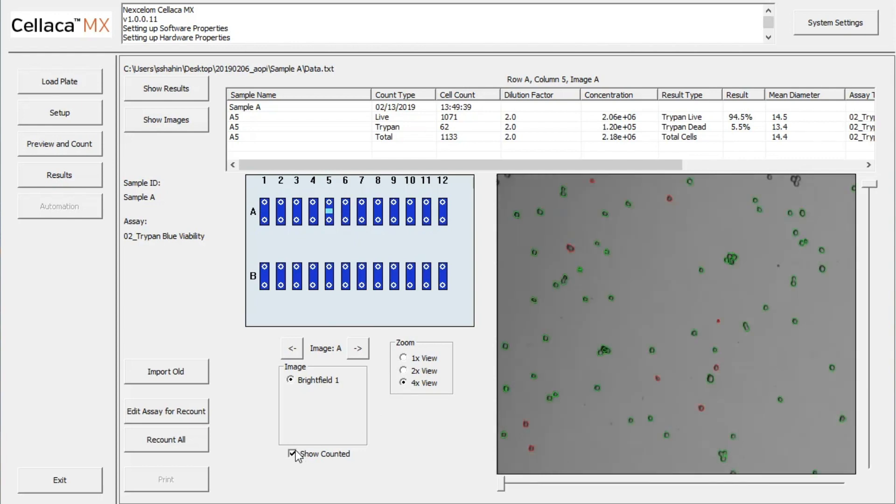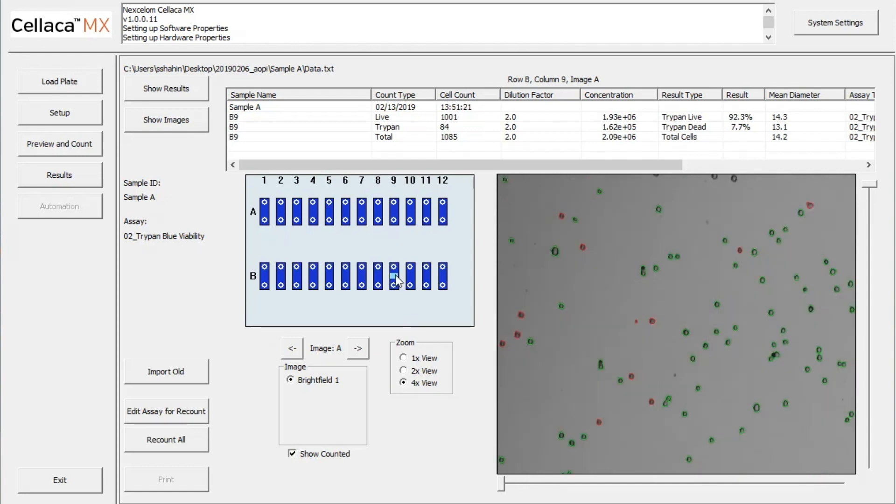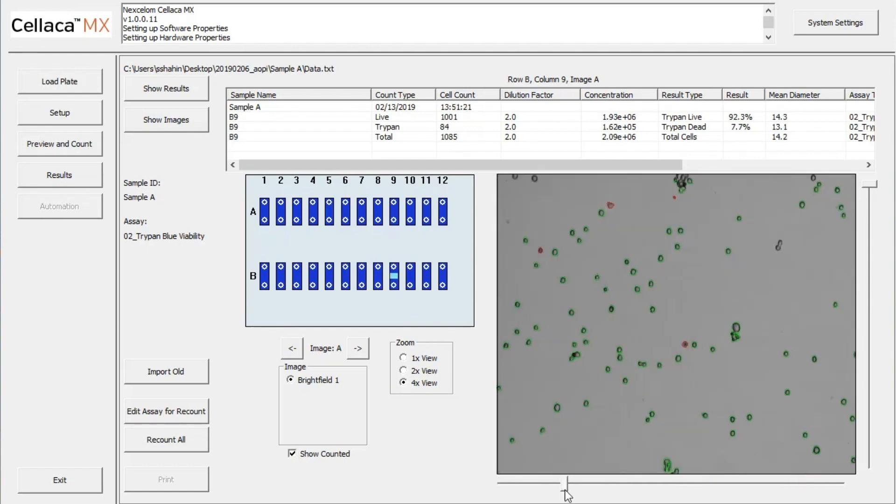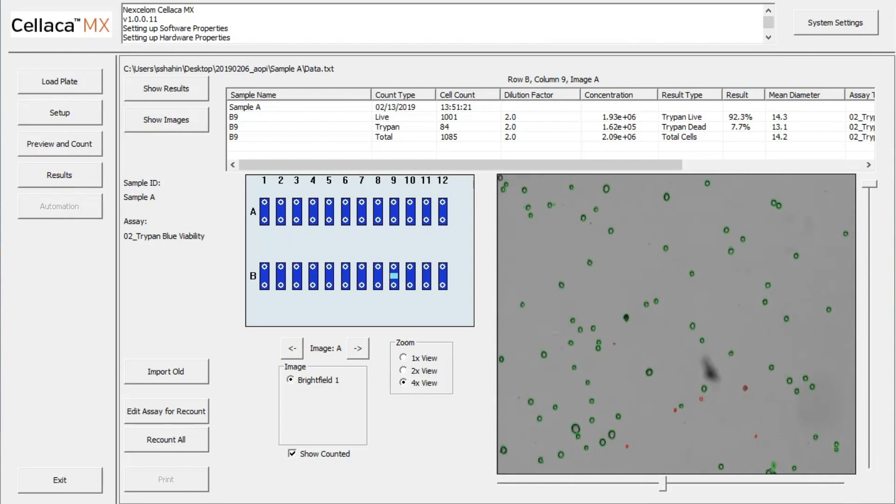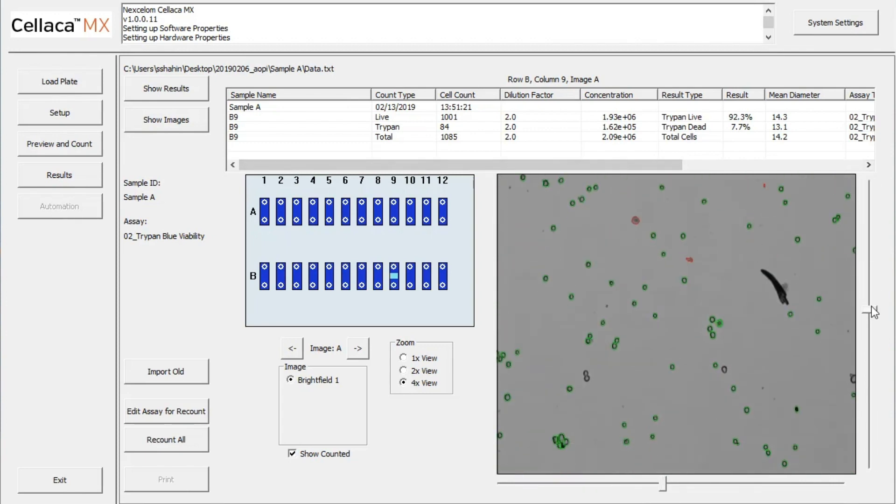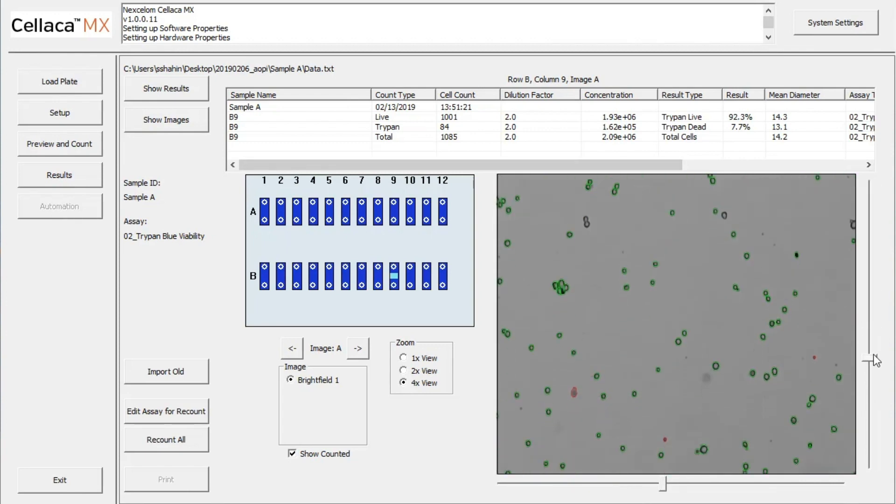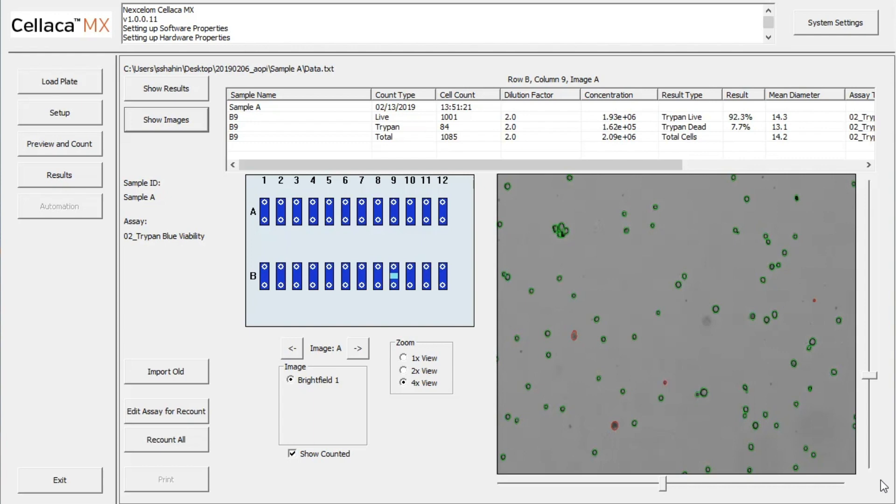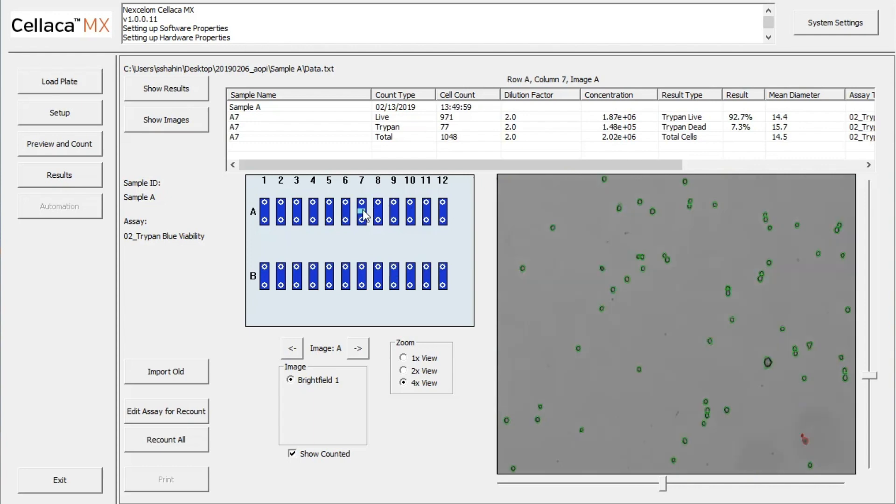Because live cells are outlined in green, and Trypan Blue positive dead cells are outlined in red, we can visually verify that all of the cells are counted, while any cellular debris is not. By navigating to different wells, we can review any sample in the plate.